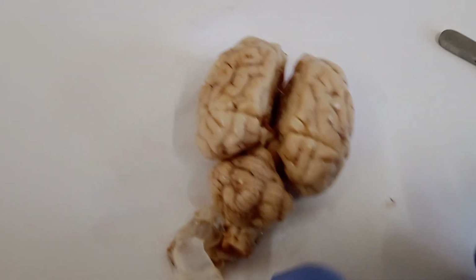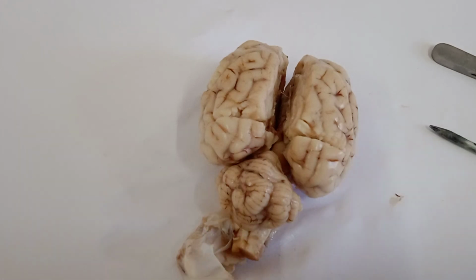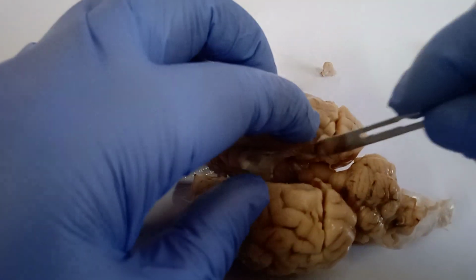So let us give the cut now. So now we can give a cut.